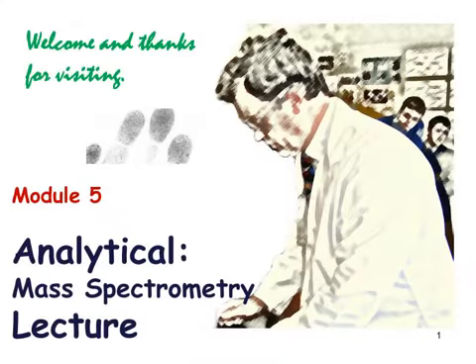Here we take a look at mass spectrometry. This is just one of the topics in analytical chemistry. In the topic analytical chemistry, we analyze chemicals to see what's present. Together with mass spectrometry, in this topic analytical, we also study nuclear magnetic resonance spectroscopy, infrared spectroscopy, ultraviolet and visible spectroscopy, volumetric analysis and chromatography.